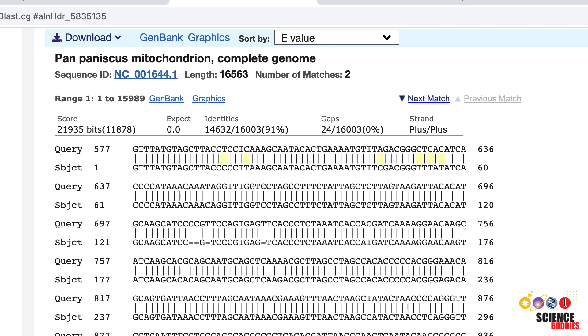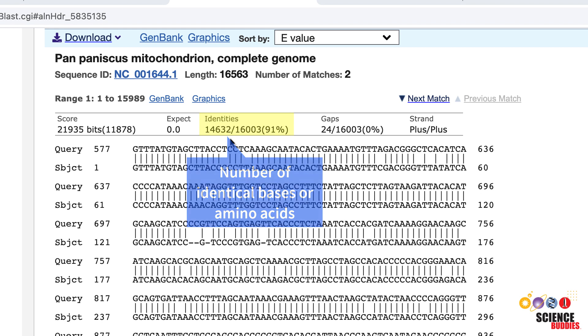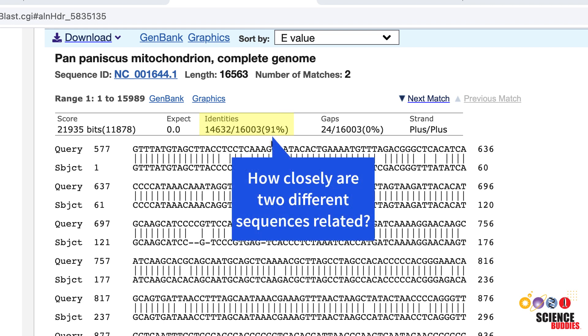Vertical lines connect nucleotides or amino acids that are identical in both sequences. No lines between the two sequences means that one sequence differs from the other, and dashes indicate gaps in one of the sequences. The sequence identity above the alignment tells you the number of identical bases or amino acids between the query and the subject sequence. The identity is also given in percent. The percent identity is a good indication of how closely related the two different sequences are.